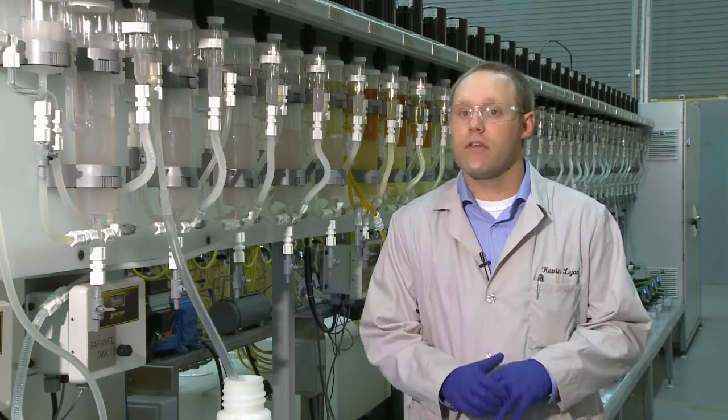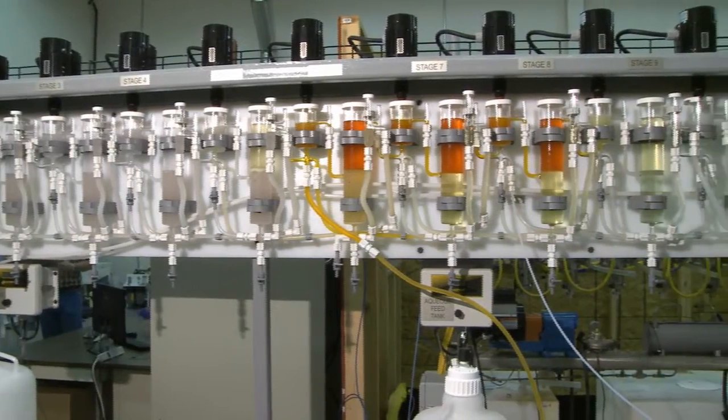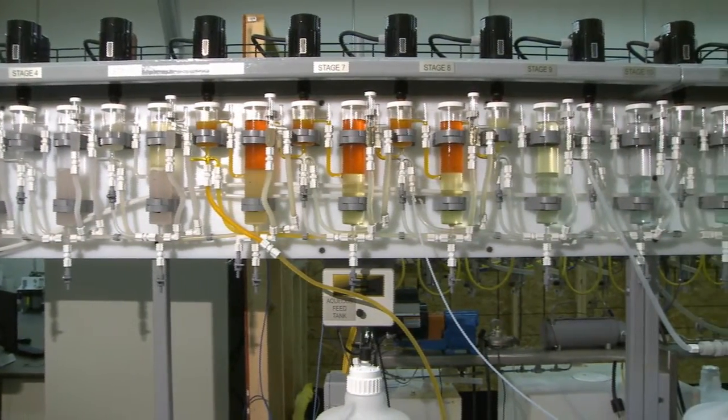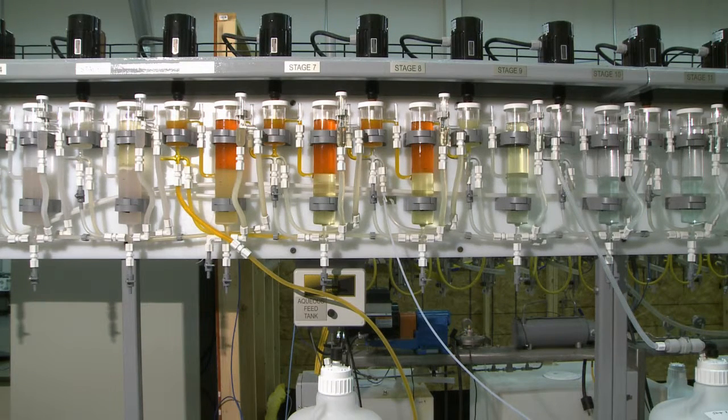The objective of this project is to develop enhanced flow sheets for the separation of rare earth elements, and we do that using solvent extraction test equipment. With this equipment we can test all sorts of different extraction systems and chemistries and look at ways that we can reduce operating costs or capital costs or reduce the environmental impact of rare earth separations.